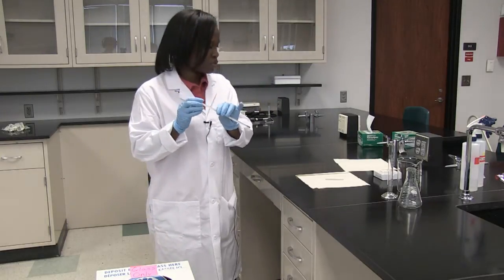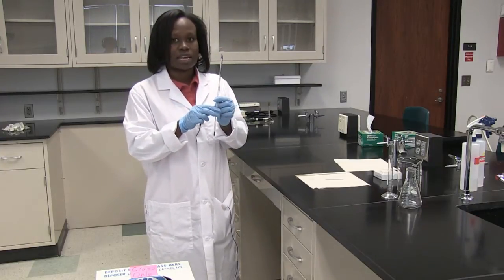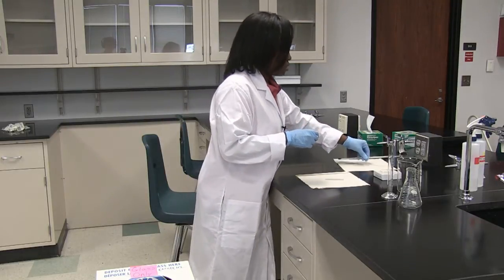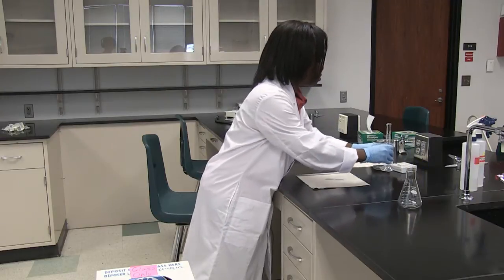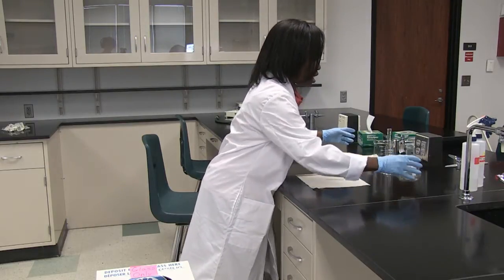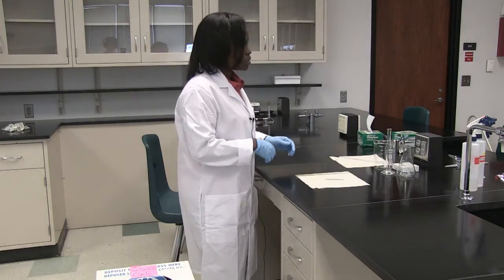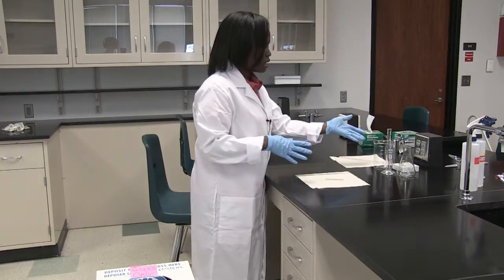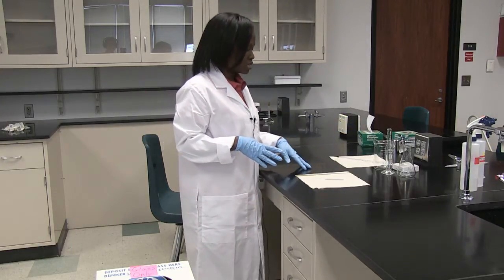So you want to be very careful when handling thermometers that have mercury. One important rule to follow when working with glassware is to make sure you keep them towards the center of your bench, away from the edge of the table or out of the reach of anybody who could unknowingly knock the equipment over and cause a breakage.